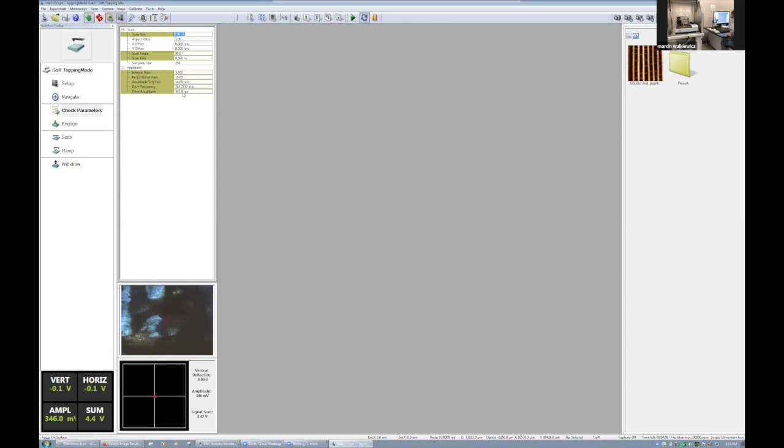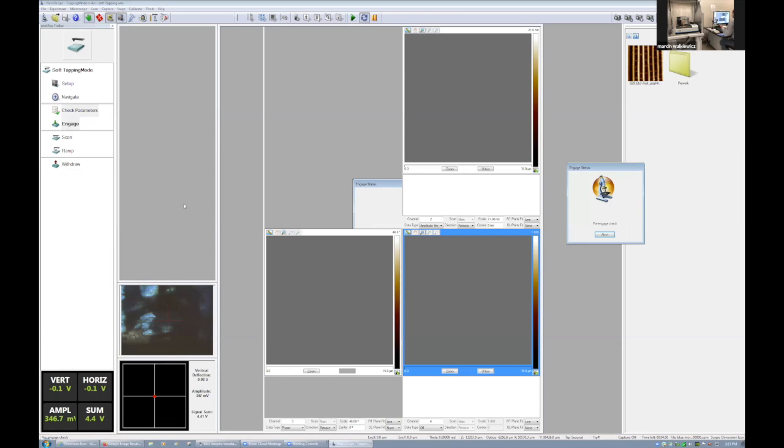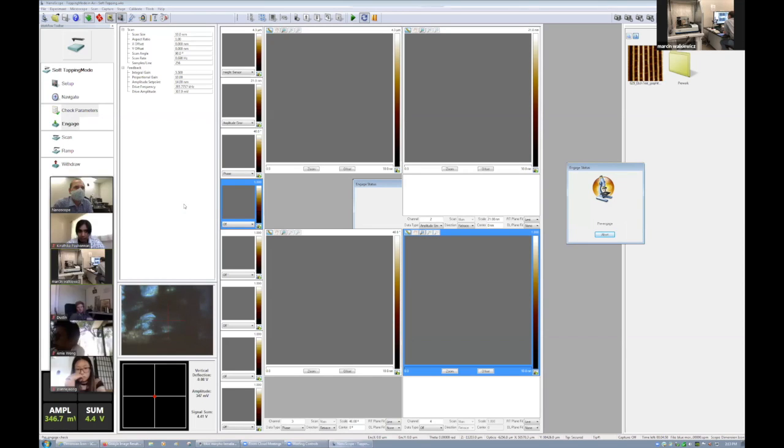And then for context, the view that you just saw is just the optical microscope. And now we're going to switch over to the AFM. So you kind of have to use both visualizations to actually get a sense. Right, so it's not a very strong optical microscope. It's like a 10x magnification. It allows us to navigate and figure out where we actually want to land. But the resolution of that microscope is about, you know, the smallest feature you can see is 1 to 2 microns, so it's not that great.